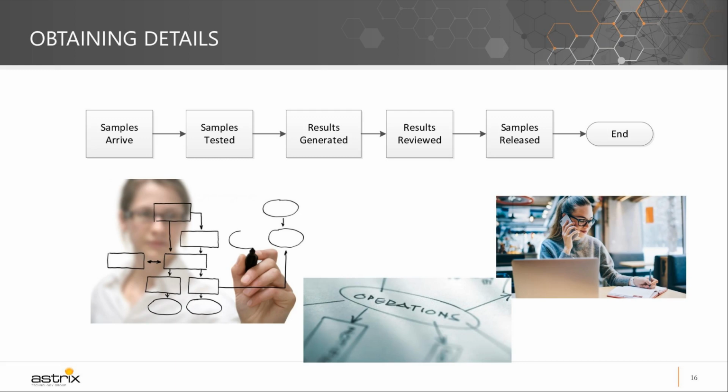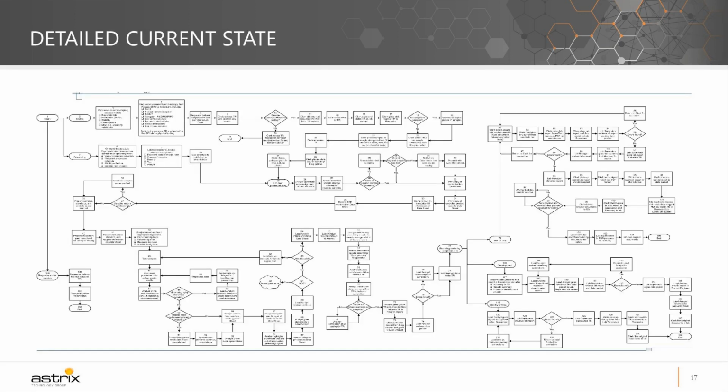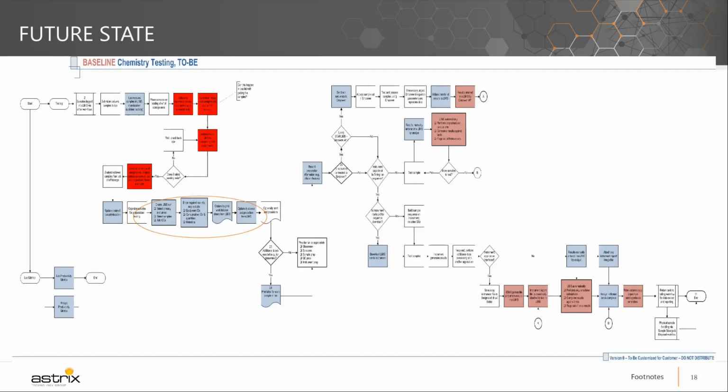But in order to develop a roadmap and to really understand that, you have to get to that next level of granularity. And coming back to this diagram, this is typically what you see. From an informatics standpoint, it will be a lot about the processes, but also how samples and data flow through the laboratory specifically. And really, this is used to understand how you're doing it and identify the inefficient areas, and when you lay it out like this, it becomes pretty obvious. Maybe the manual processes, and then you can work internally to develop something that's a lot more efficient.